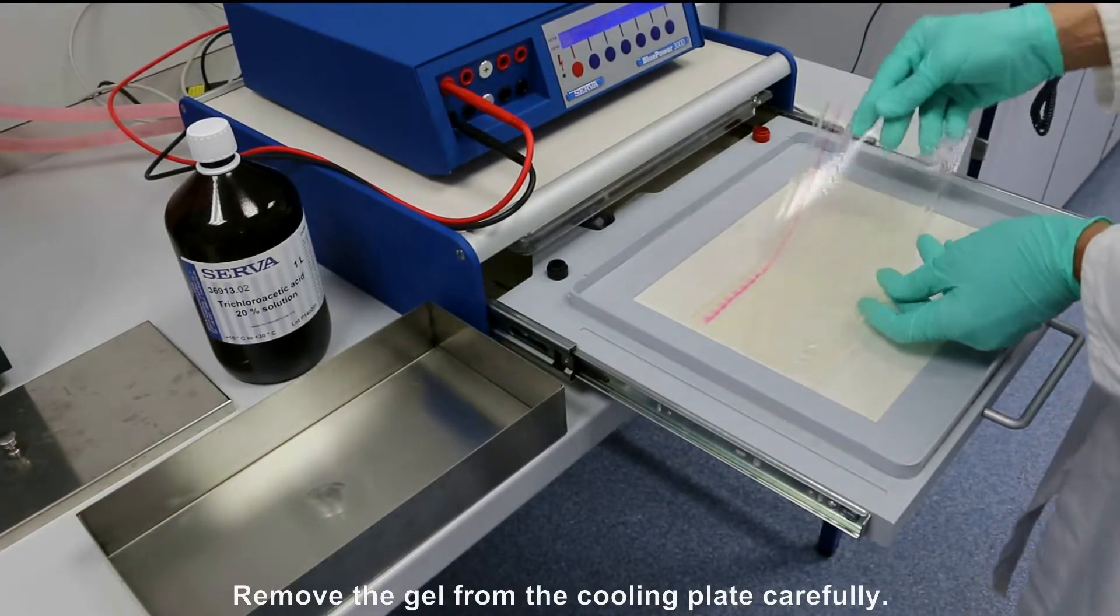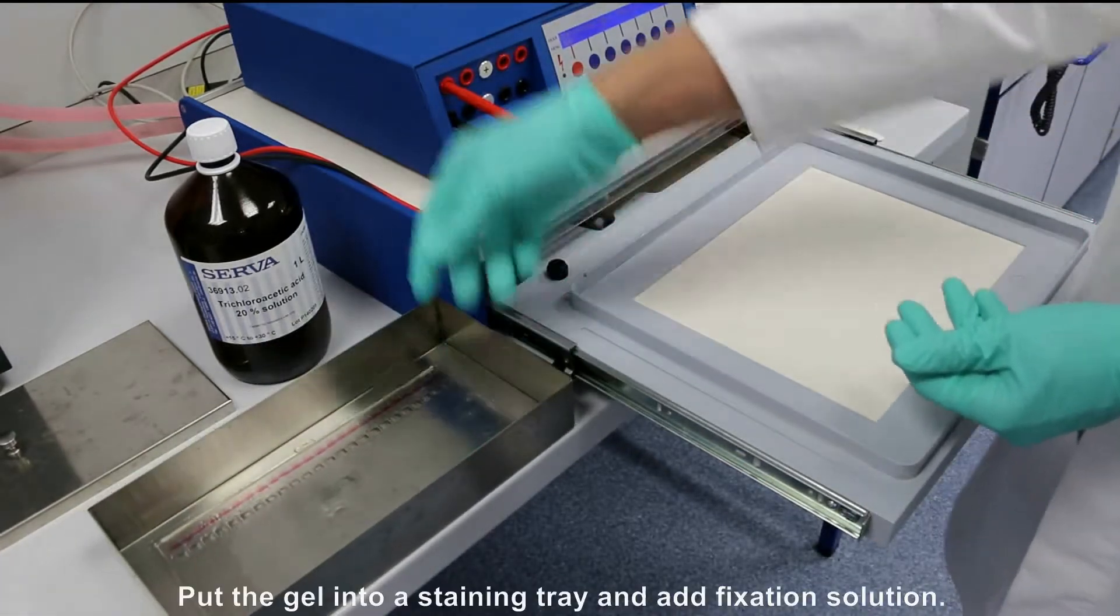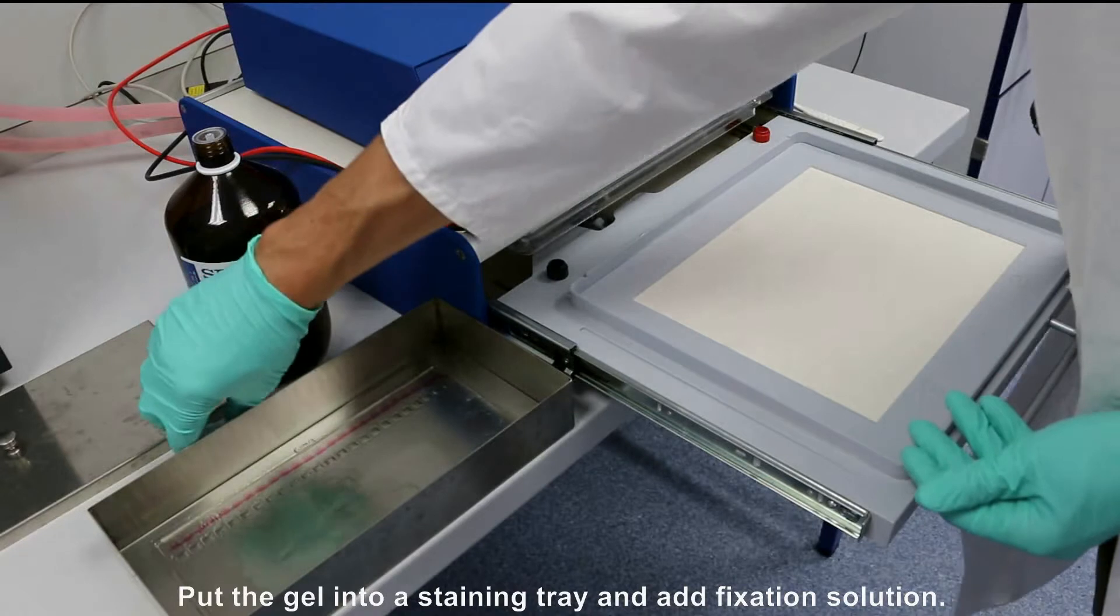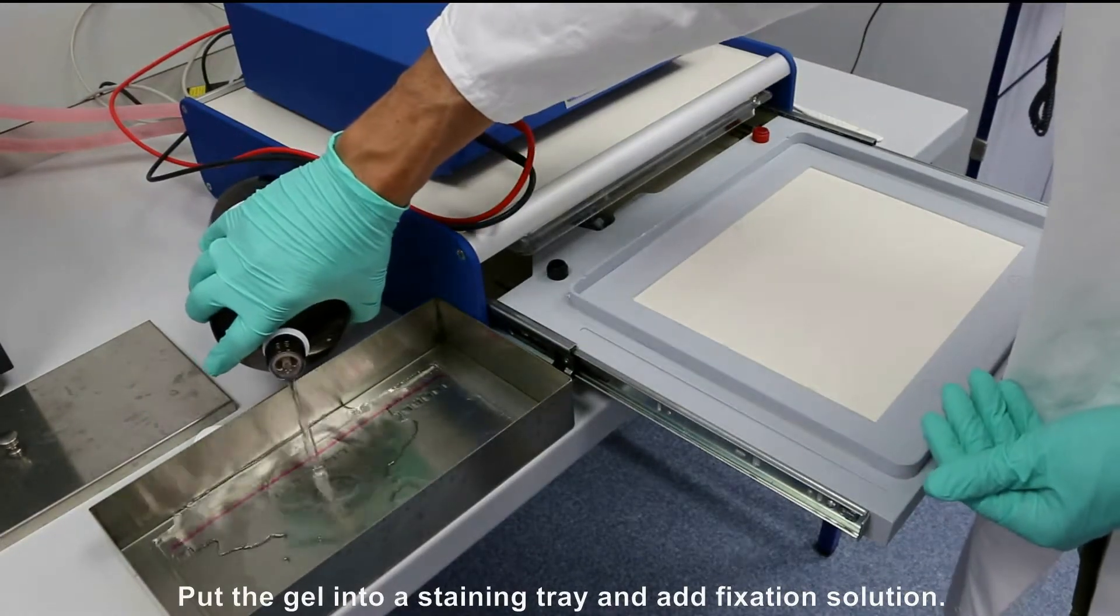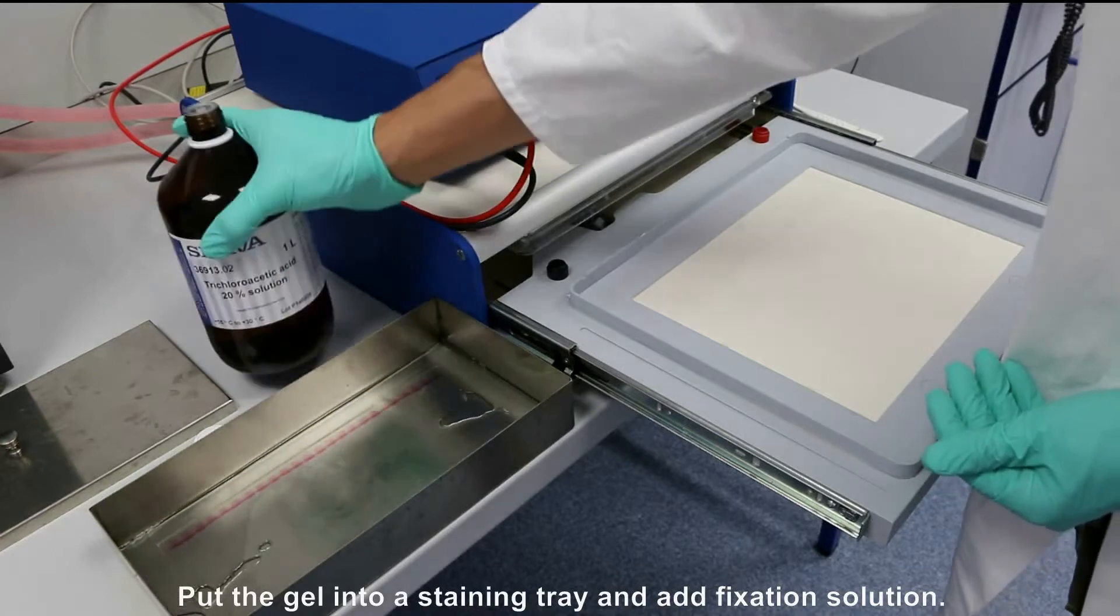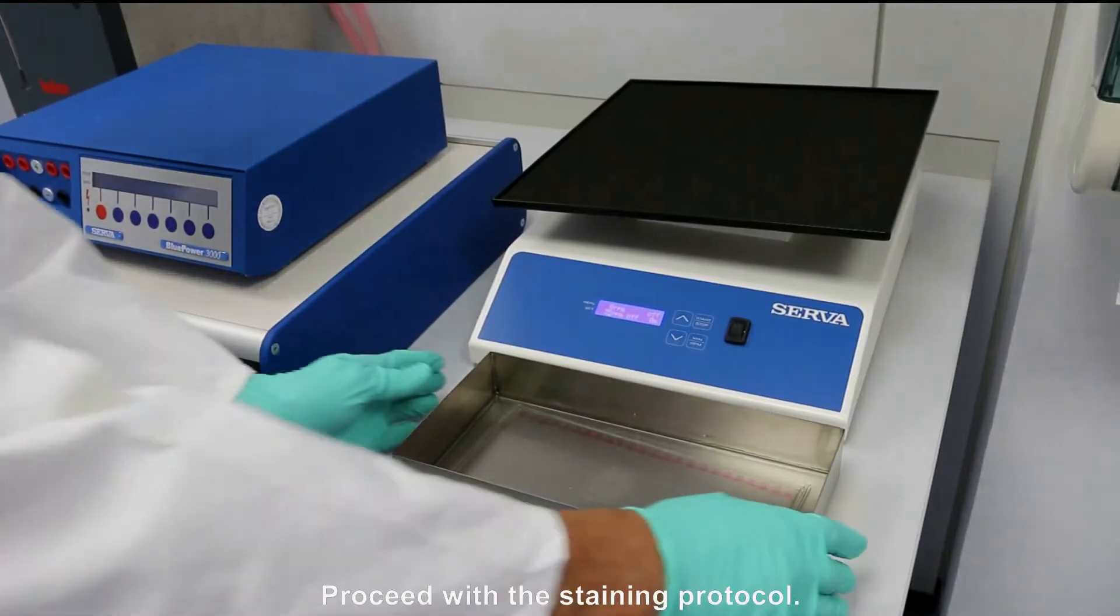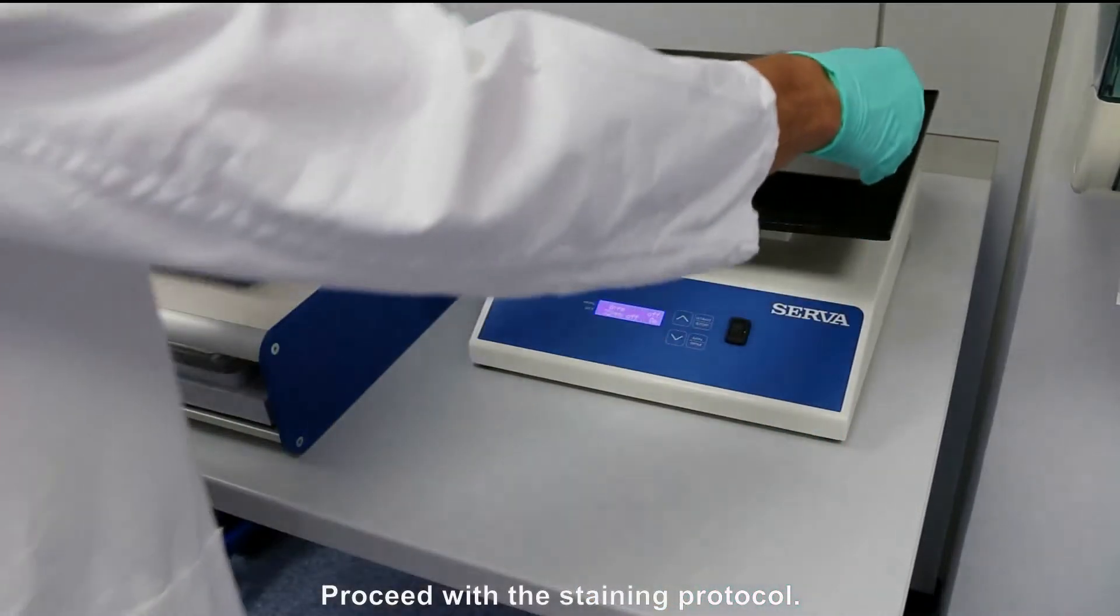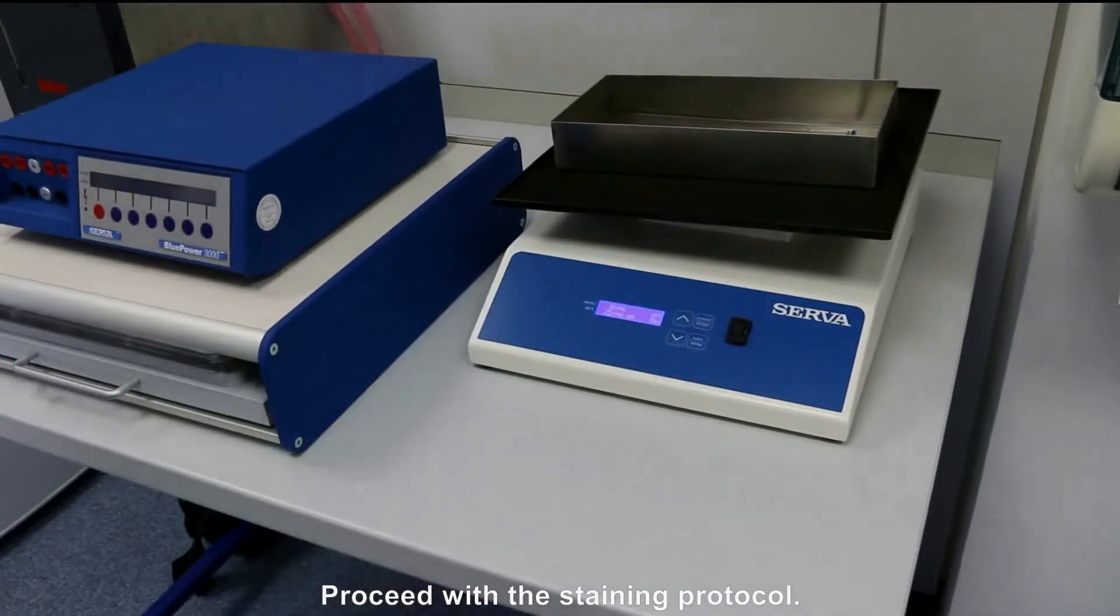Remove the gel from the cooling plate carefully and place it in a staining tray. Immediately add fixation solution. Place it on a 3D shaker and proceed with the staining protocol.